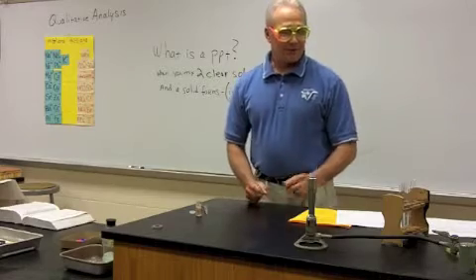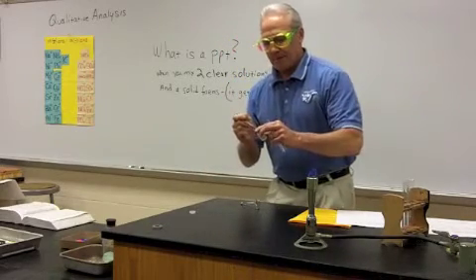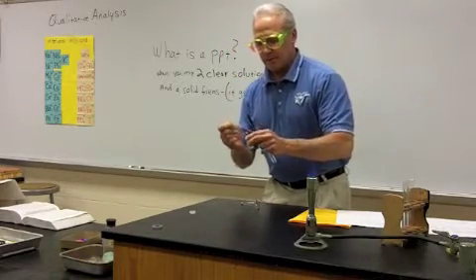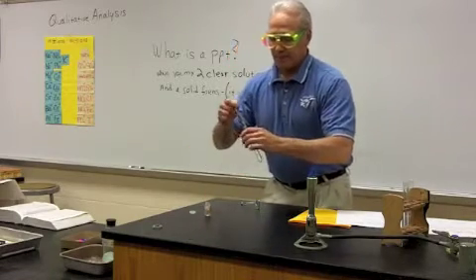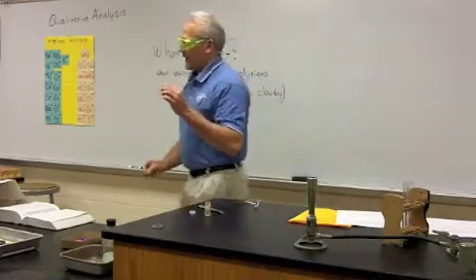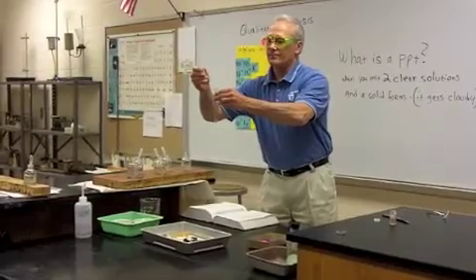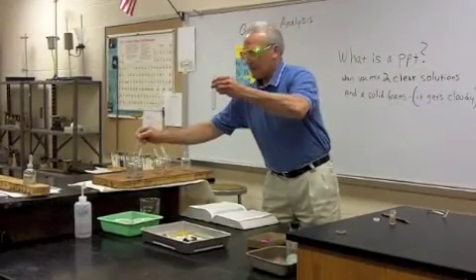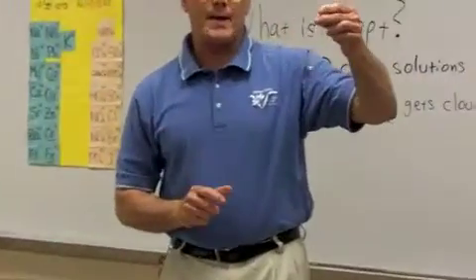For the fifth test, you're going to need a dry test tube and a small sample of your unknown. This test is called the dilute sulfuric acid test. Put a sample into a dry test tube. What you'll then do is add 5 drops of dilute sulfuric acid. And we look for bubbling to occur as we're adding the acid. That did not happen here.